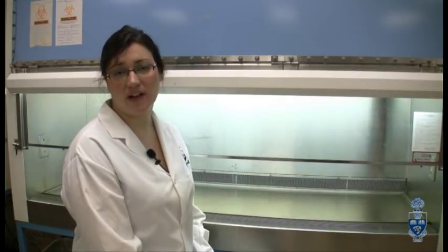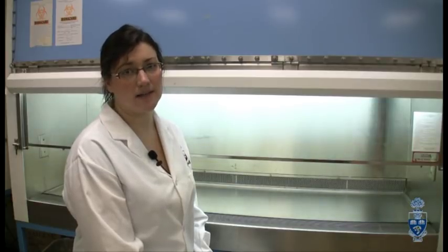One of the most important things about working in cell culture is that we maintain a sterile working environment. In order to achieve this we use airflow hoods like this. Airflow hoods provide a barrier against the external environment because if things like mold or bacteria were to get into your samples they would invalidate the results and you would need to start again.